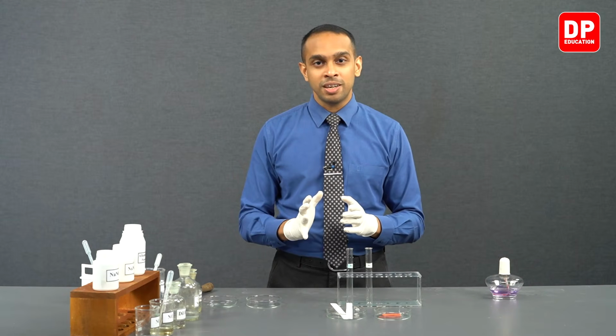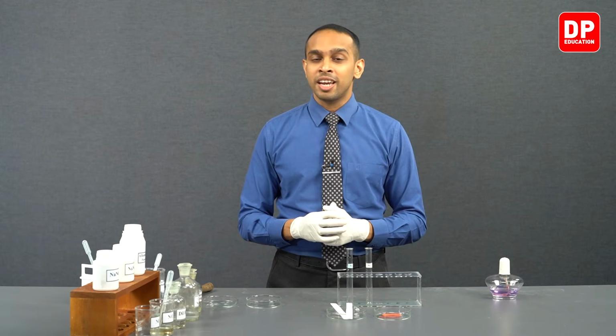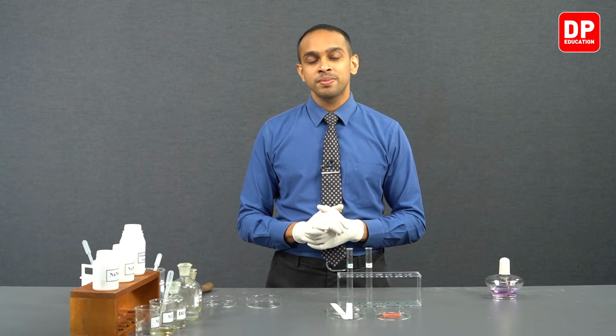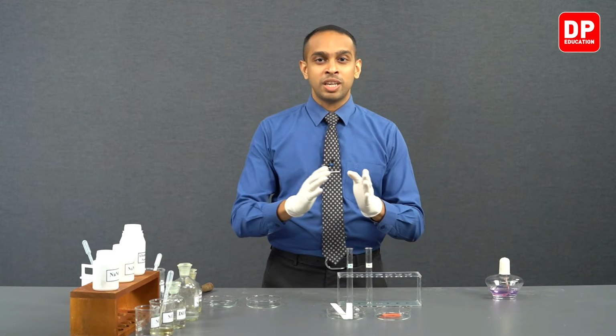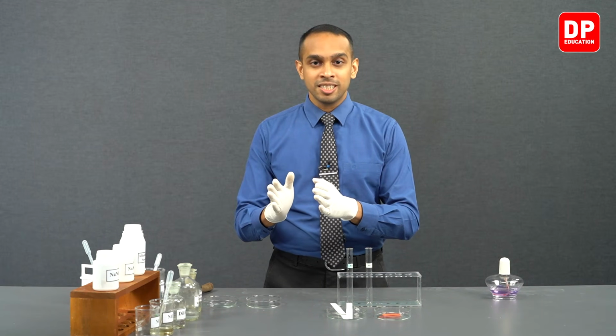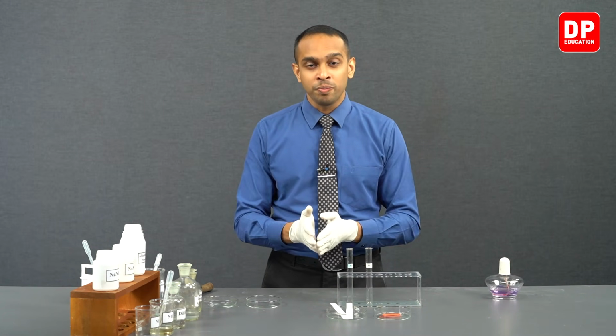So as aluminium gets oxidized, you will observe that the nitrate ions or the nitrite ions get reduced to form ammonia. So aluminium gets oxidized to form aluminate ions, and nitrate and nitrite ions get reduced to form ammonia. And we can test the presence of ammonia with the use of a wet red litmus paper and with the use of a Nessler reagent soaked filter paper.